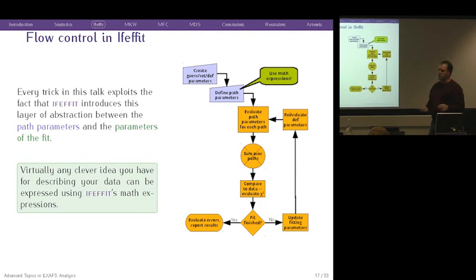So you define a set of parameters. You define a set of path parameters. In the context of Artemis, here you fill in the window, the guess def set window, that table of parameters. Here you fill in the boxes for all of the paths that you include in the fit. So these two things together are what you do to define your fitting model.